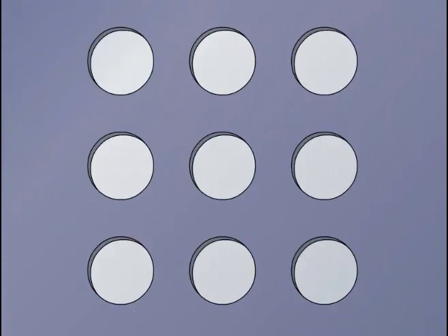There are several ways to make a microarray. The one described here involves a methodology adapted from computer chip technology. A piece of glass, about 1.5 by 1.5 centimeters, is covered with a mask containing holes corresponding to the sites of attachment of the desired nucleotides.